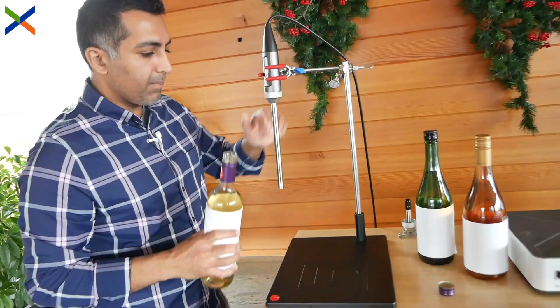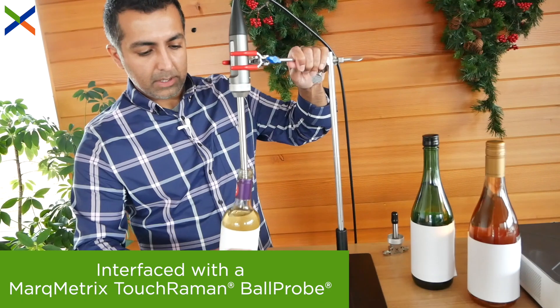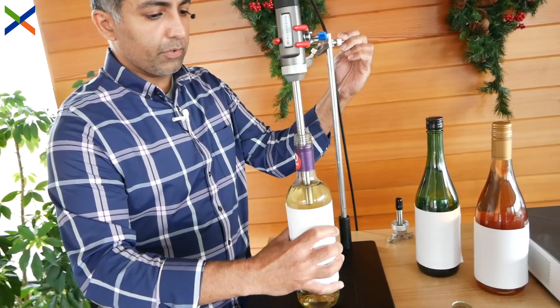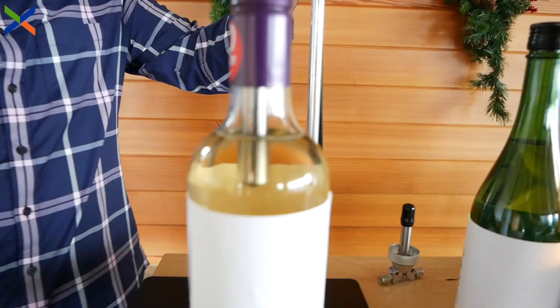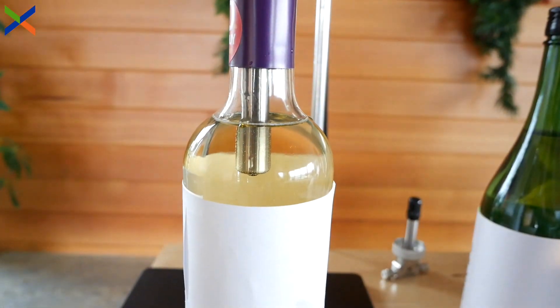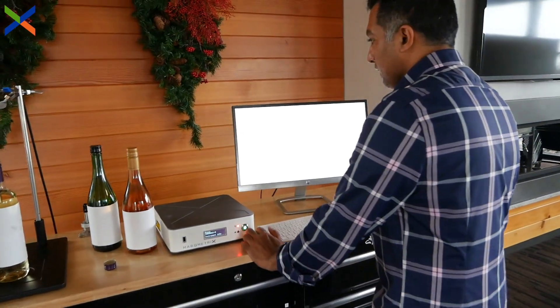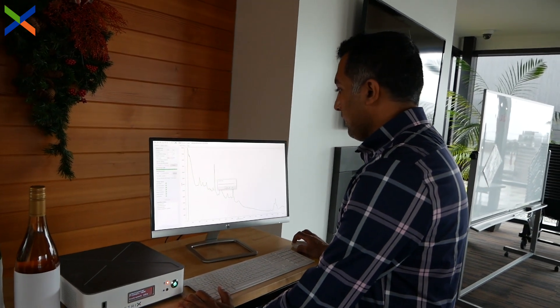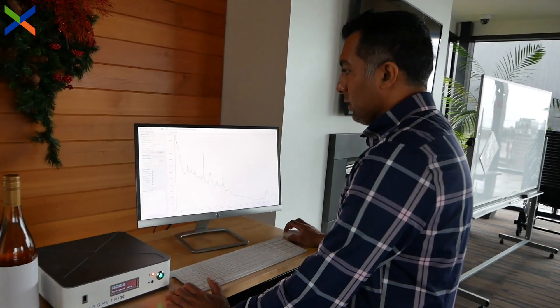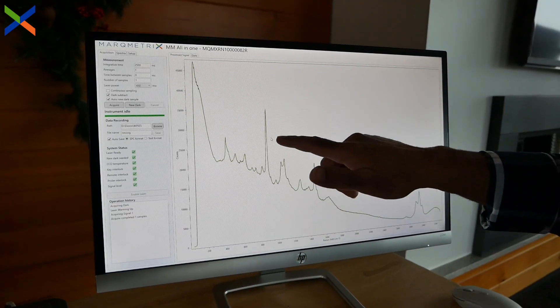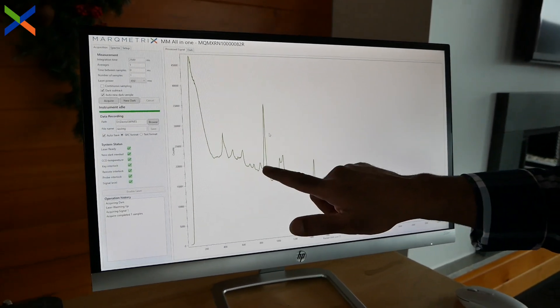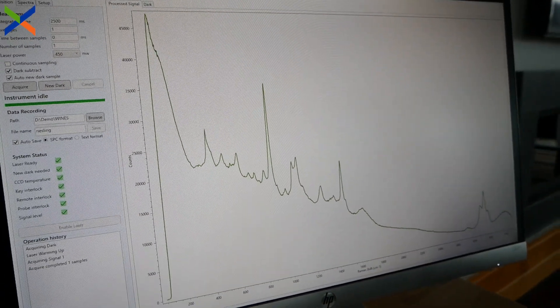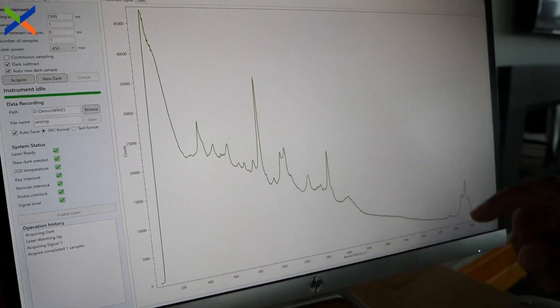We'll use our standard MarkMetrics Touch Raman ball probe to measure the Raman spectrum of the Riesling directly in the bottle. We go to the computer, set a few parameters, and in a couple of seconds we get our Raman spectrum. Here you can see the highest peak coming from the alcohol — that's just one of the peaks for alcohol; there are multiple peaks in here that belong to alcohol.